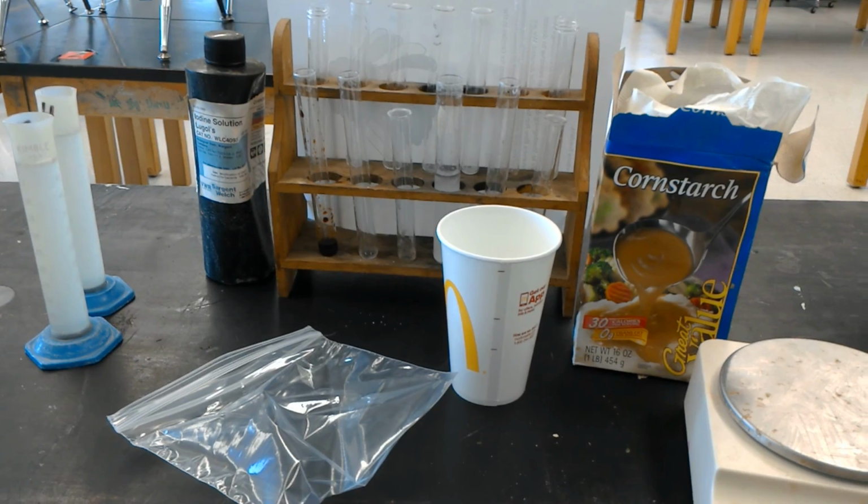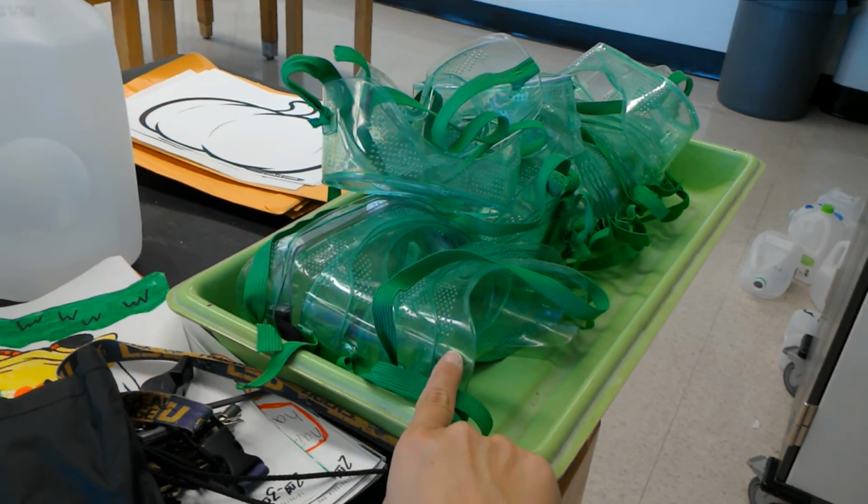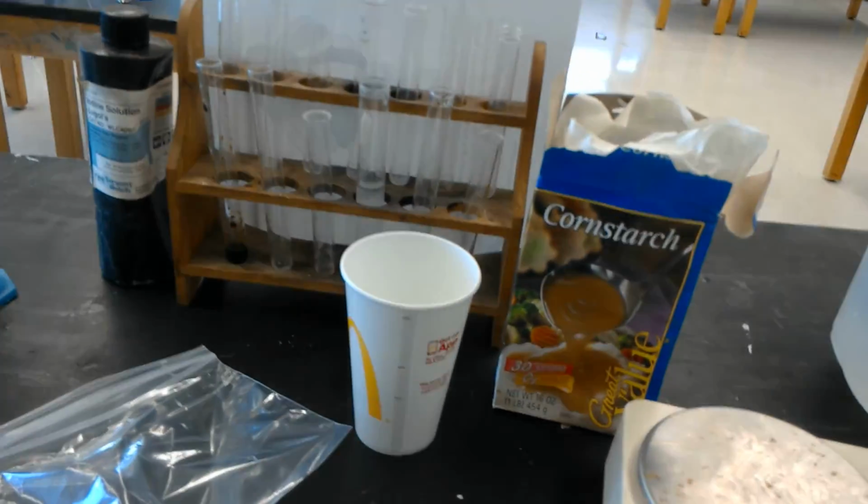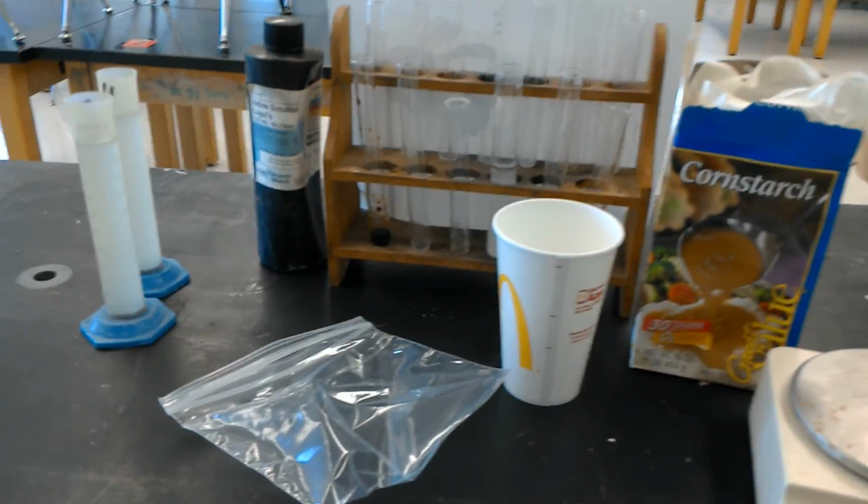Before you get started with the lab, it is imperative that you focus on safety and that you wear the safety goggles at any time that you are dealing with the components of the lab. See, I'm even wearing them too. Okay, hopefully you saw that.